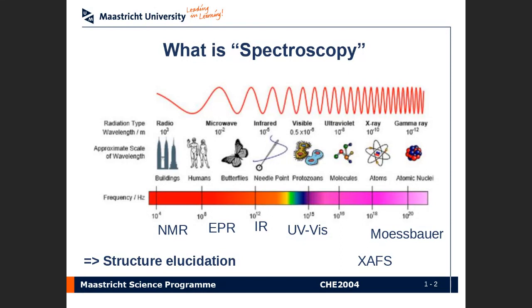And if we see here, just to remind you from basic physics, we have the electromagnetic spectrum. We have, of course, on the one end, the gamma radiation, extremely short wavelengths with very high associated frequencies. To the other extreme on the left here, we have radio waves with very long wavelengths, in the order of 1,000 meters or even more, the radius or the diameter of the Earth even. And everything in between: microwave radiation, infrared, visible, ultraviolet, and X-ray radiation.